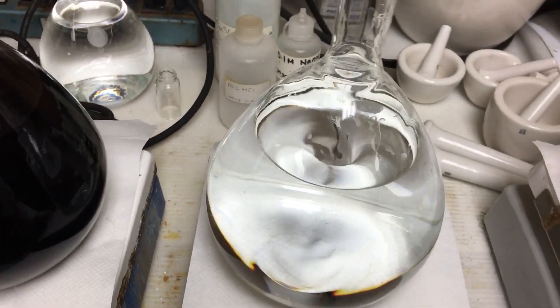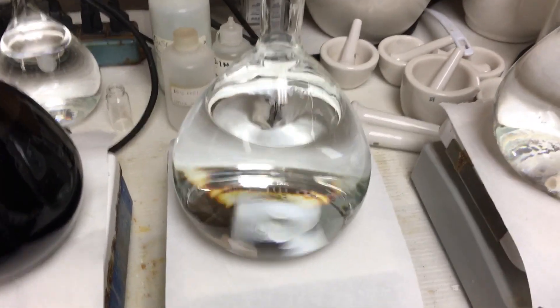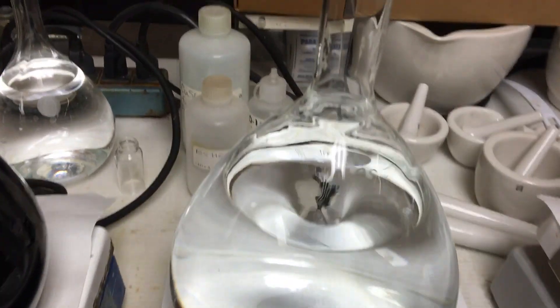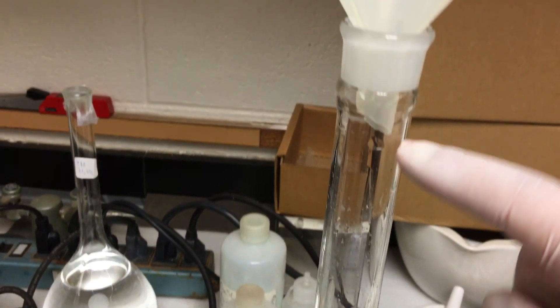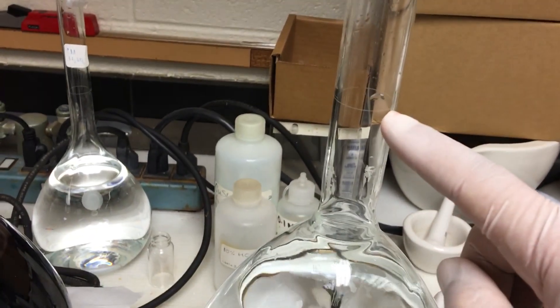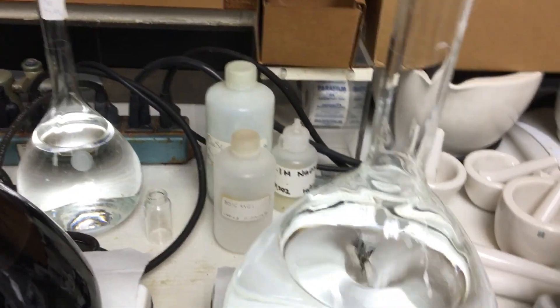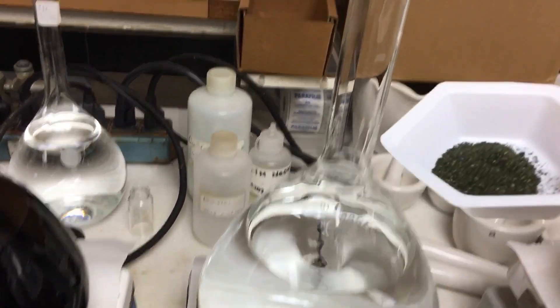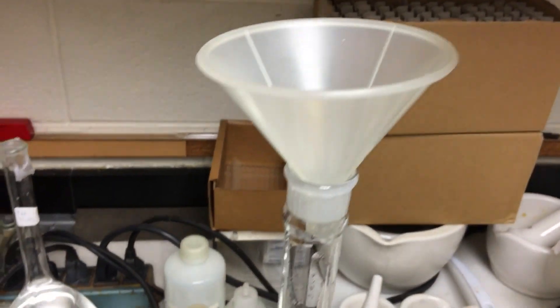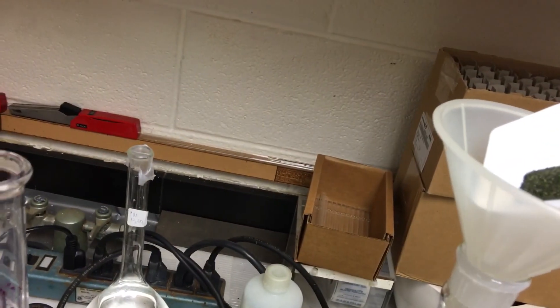This is the 2-liter volumetric flask — I've already started filling it. Make sure when you volume up, you fill all the way to the line right here. You need to QS — quantity sufficient — up to the 2-liter mark. So here we go with the 6.322 grams.